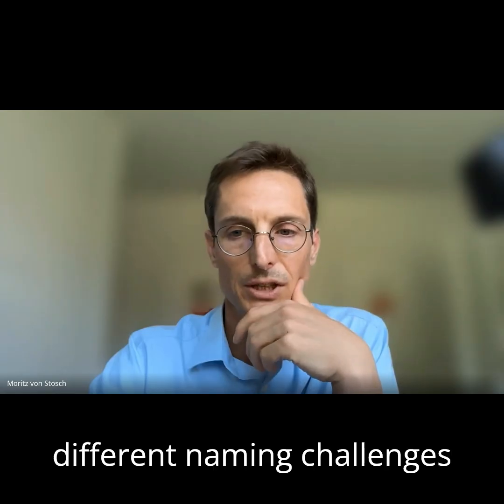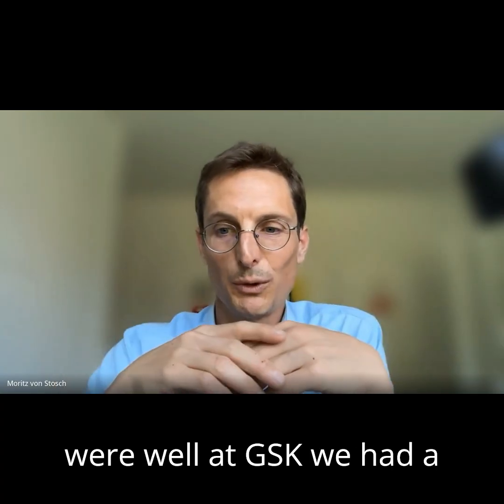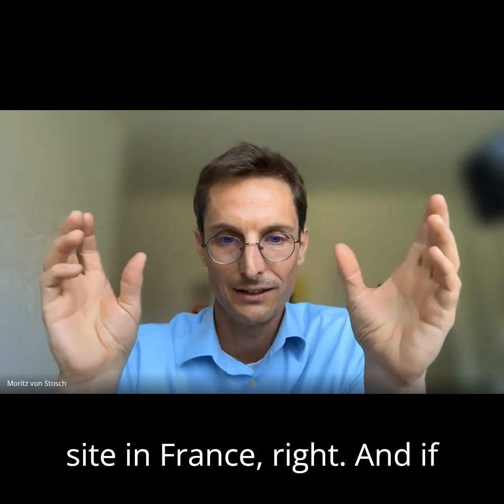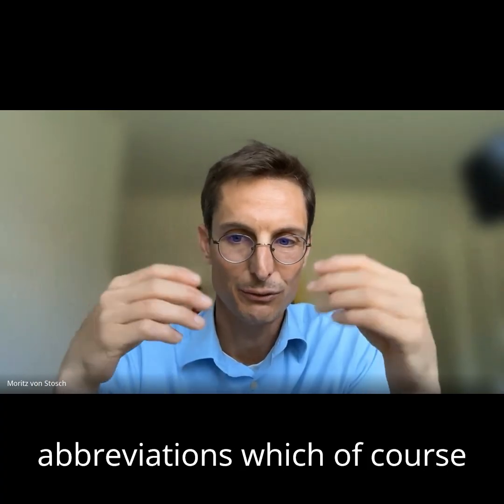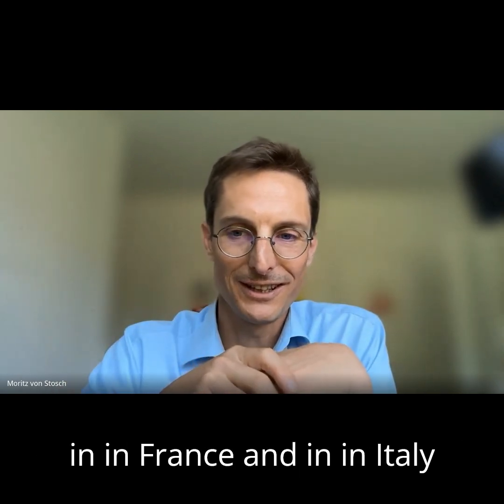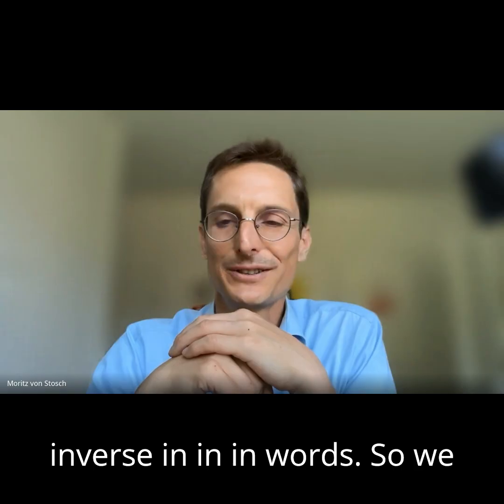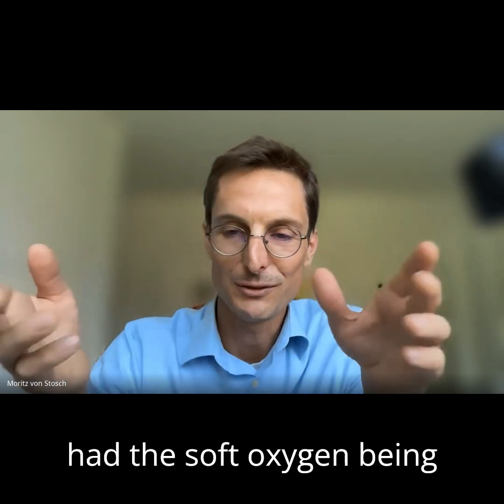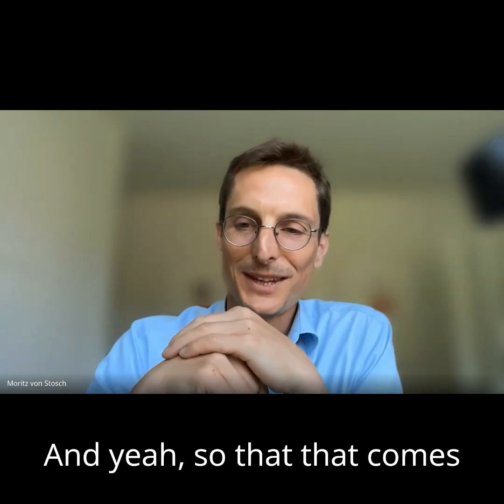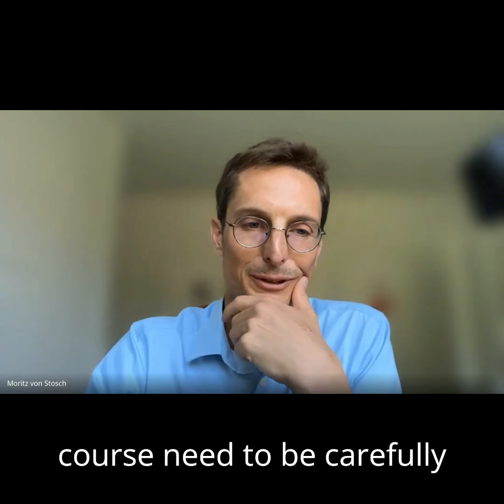Then there's of course different naming challenges which you might have if you have different sites in different countries. Yeah, well, at GSK we had a site in Italy and a site in France, right? And if you look at the abbreviations, which of course follow the way variables or namings are used in France and in Italy, then in French we saw the inverse in words. So we had dissolved oxygen being OD rather than DO, because it's oxygen dissolvé. And yeah, so that comes with challenges, which of course need to be carefully handled.